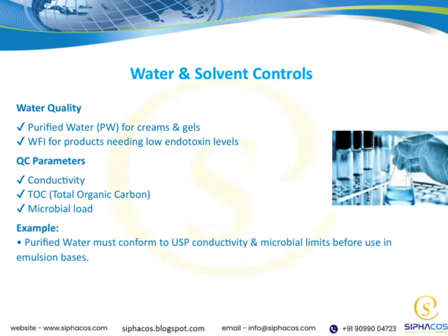Let's talk about water and solvent controls. First, water quality is crucial in our formulations. We use purified water, or PW, mainly for creams and gels, because it meets the necessary purity standards for those products.